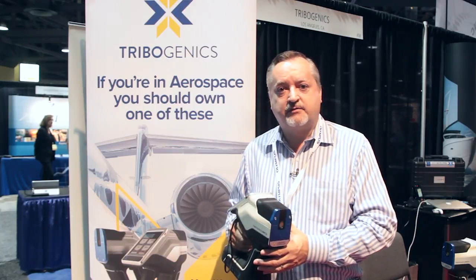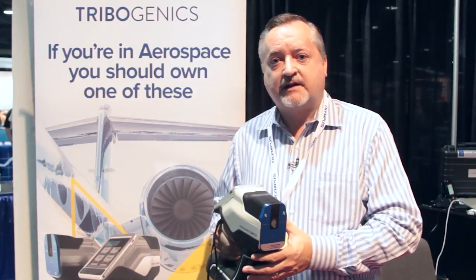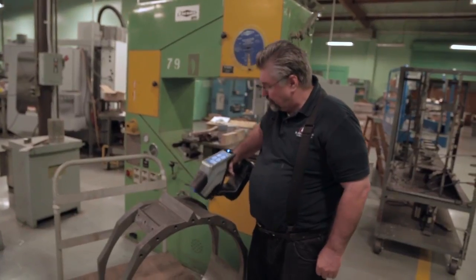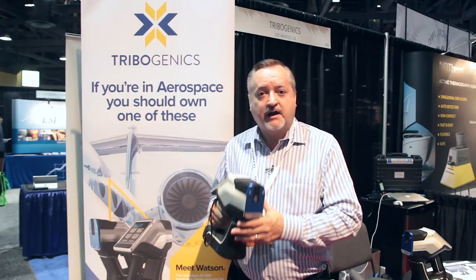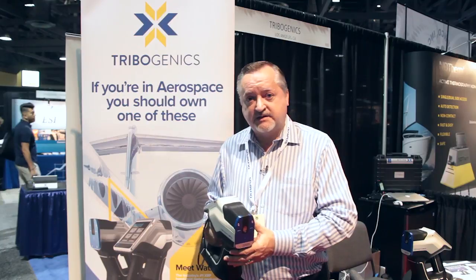The big problem for people right now, if you're machining parts or making parts for aerospace, is low quality metals coming in from overseas. Watson is low cost insurance. In fact, if you're manufacturing aerospace parts today, some companies like General Electric — GE Aerospace — are actually mandating that you have to have a handheld XRF device by April of next year. So Watson is there as basically low cost insurance so that you can QC incoming metals and QC outgoing materials and make sure that your parts are made correctly from the right material.